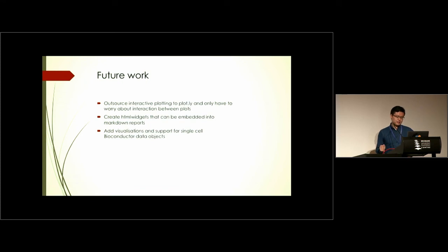And as part of future work, what I would really like to do is make use of the more modern tools. So taking things like Plotly, and if anyone went to Carson Sievert's talk about interactive web graphics, there's a lot of development in that space now that makes it a lot easier to implement what I have without having to go down to very low-level code.